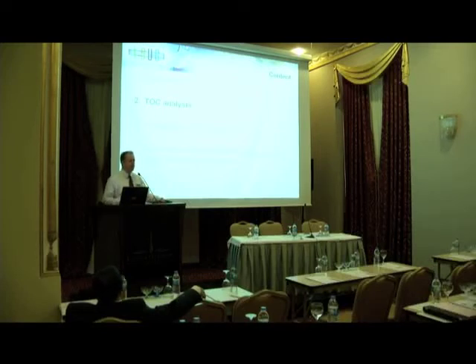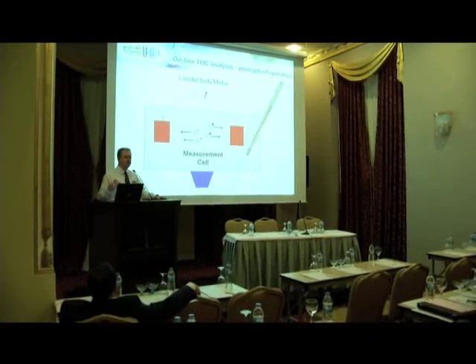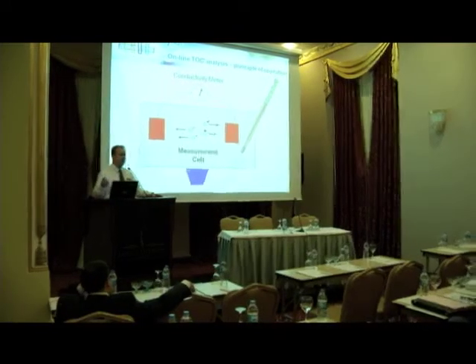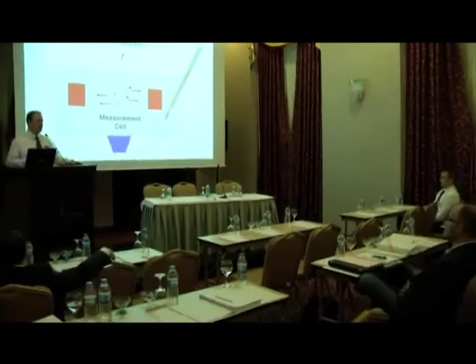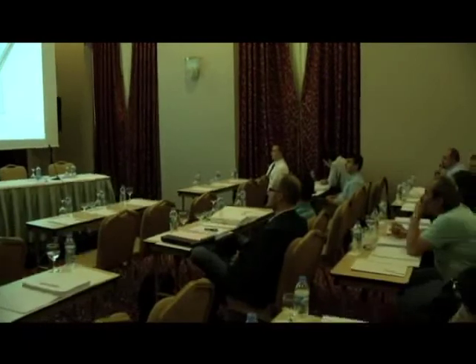Now to total organic carbon. The reason I talked about conductivity is because in the typical TOC analyzers that you will see on a pharmaceutical grade water system, they are effectively conductivity meters. All the TOC analyzers use conductivity to measure organic carbon. I'll explain how they do it in a minute, but effectively they are temperature compensated conductivity meters.